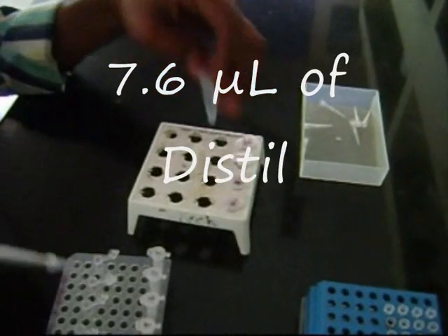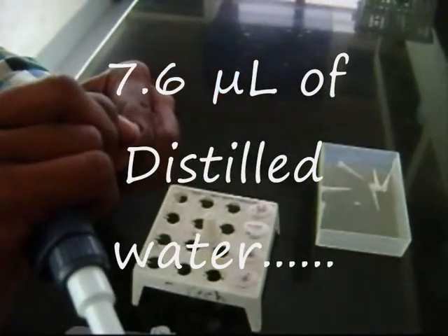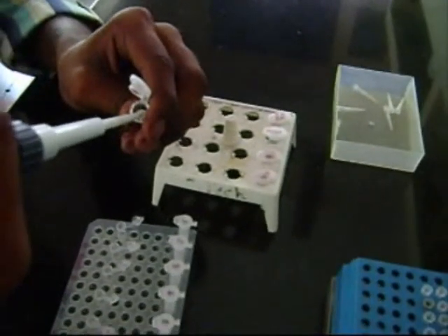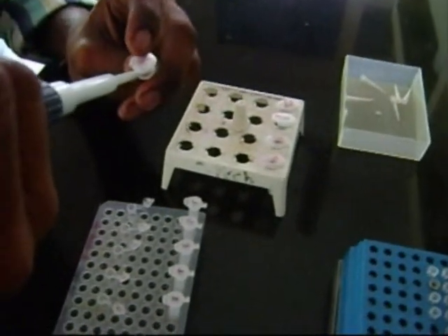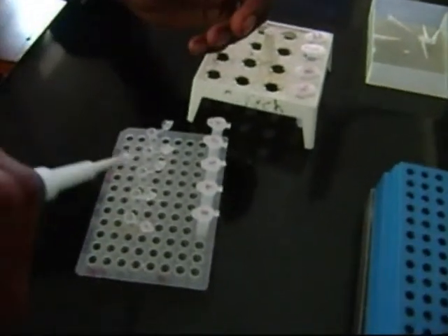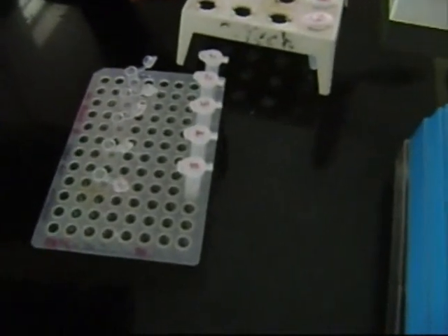7.6 microliter of distilled water is added to each tube. The distilled water is sterilized before use and must be free from DNA. It is added to make up the concentration of the different components in the final reaction mixture and acts as the medium for the reaction to take place.